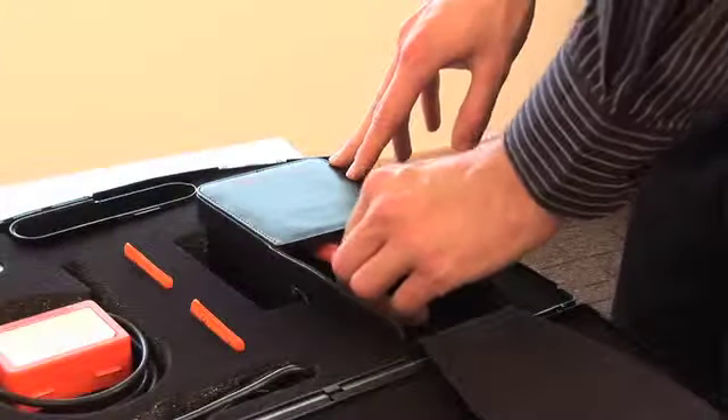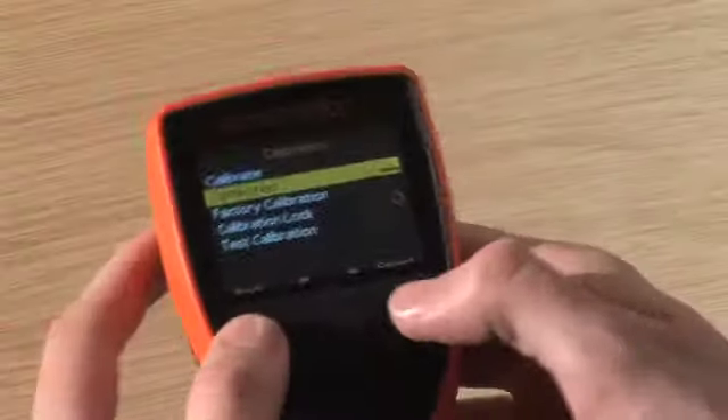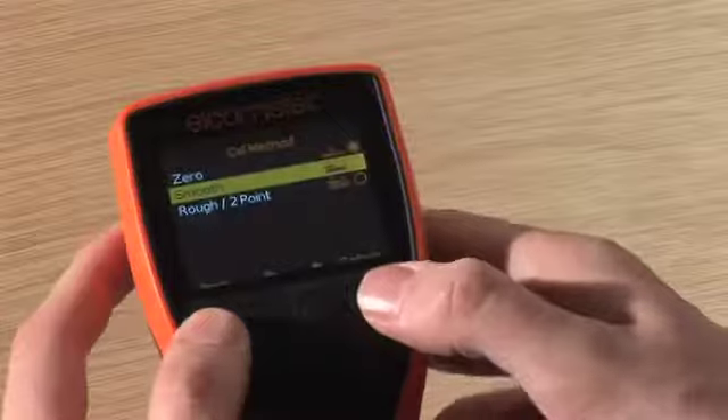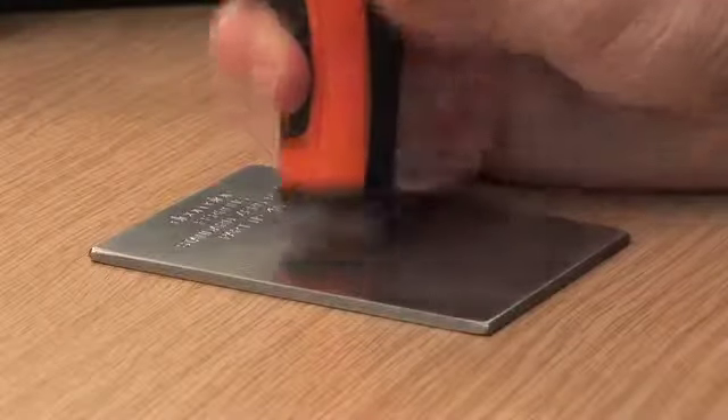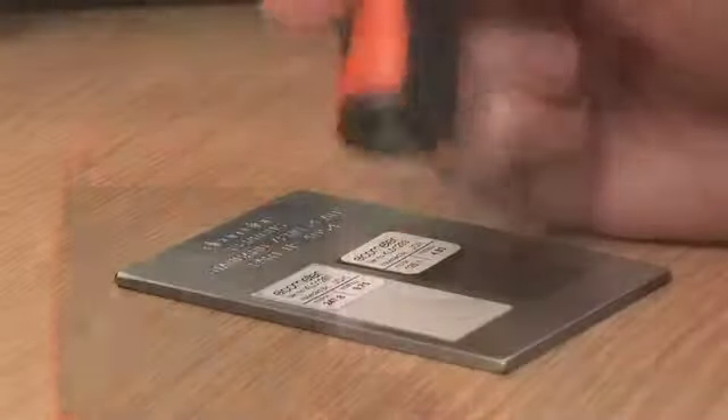Each gauge is factory calibrated and ready to use out of the box. To get the best performance from your gauge and make best use of the gauge's 1% accuracy, adjust the calibration to suit your specific application using the gauge's internal calibration routines.